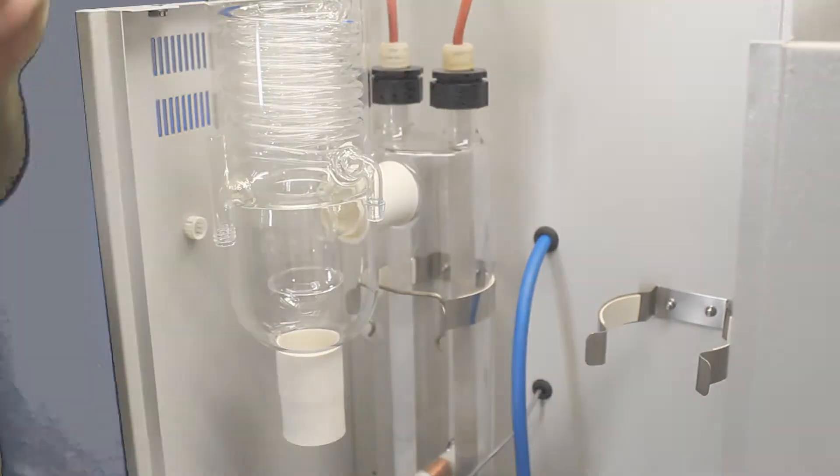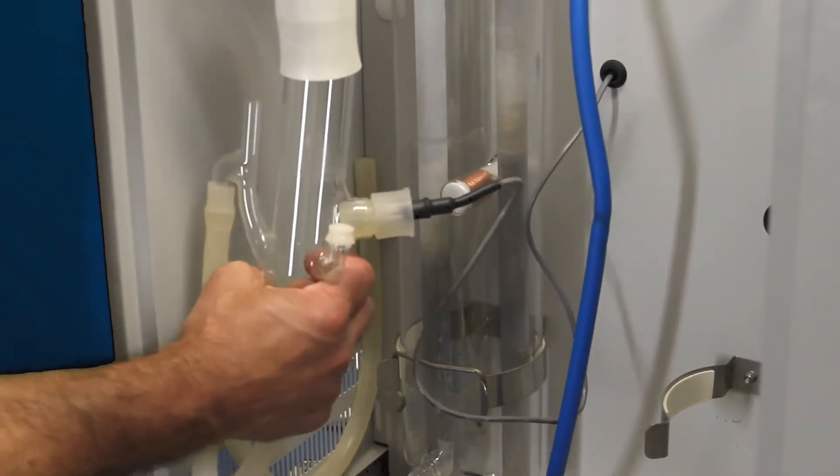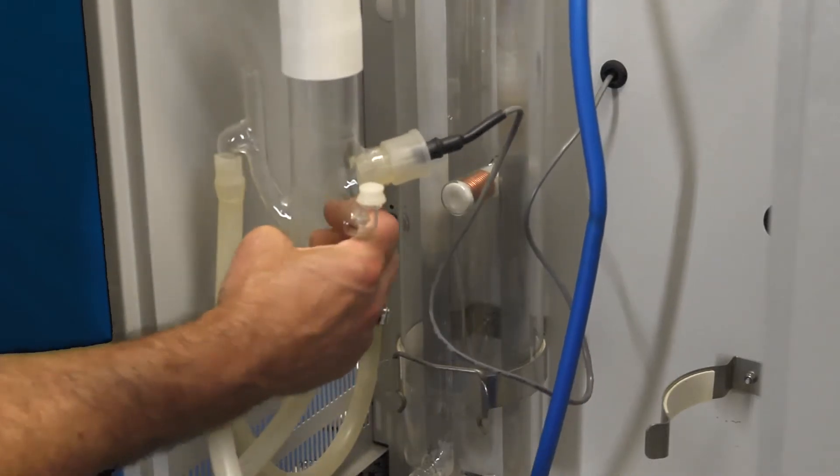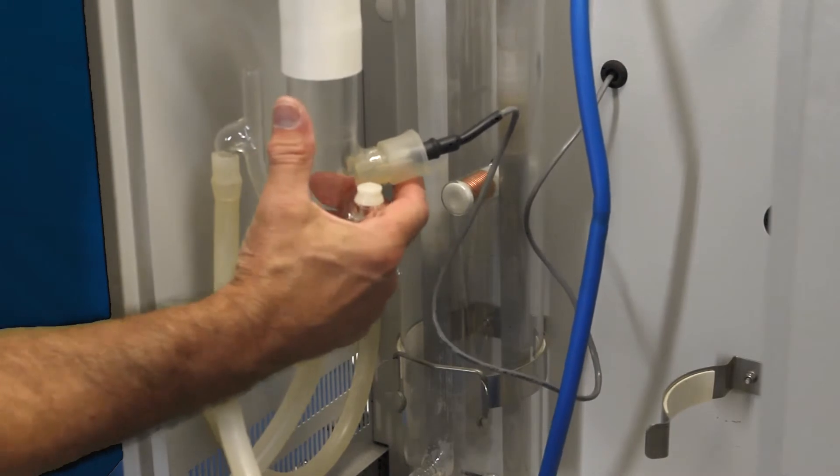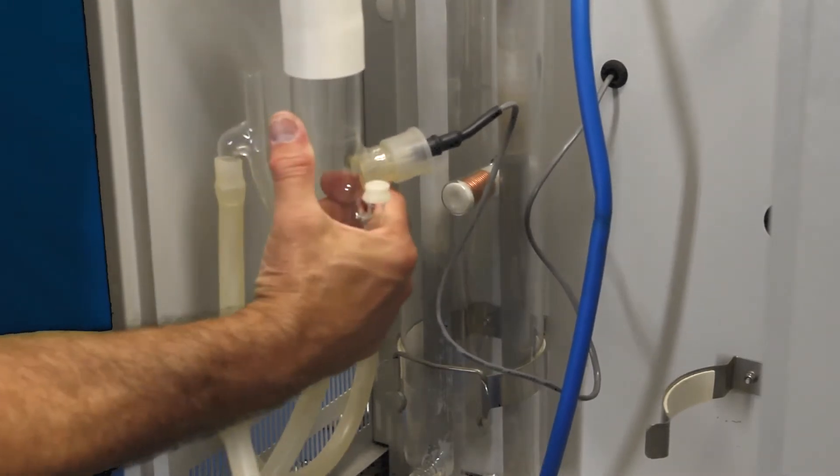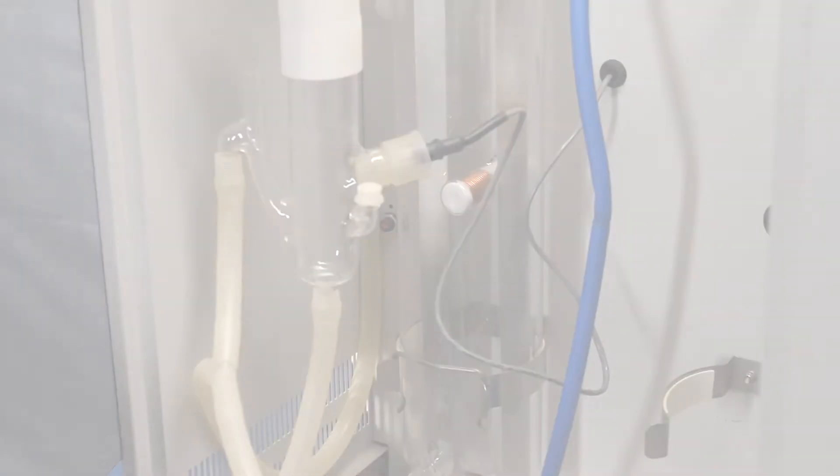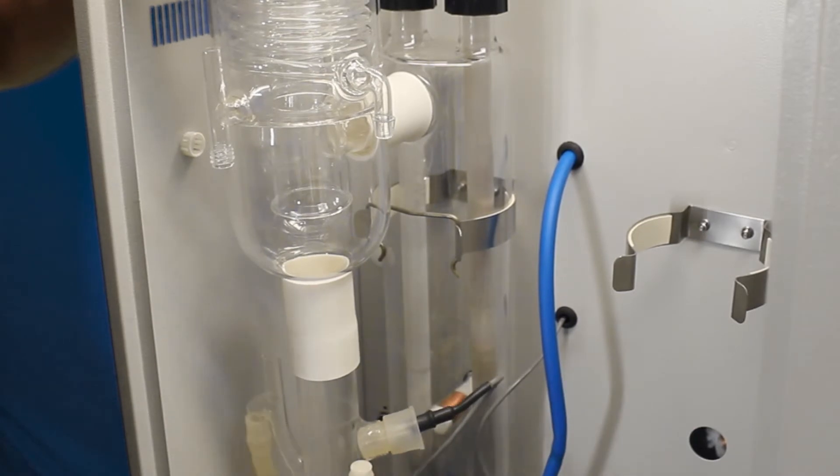Take our constant level device. Slide that back up inside. You want to leave yourself about a sixteenth of an inch gap because you don't want a glass-to-glass connection. Slide it up until you get just about a sixteenth of an inch gap right in there. Turn that to the proper position.